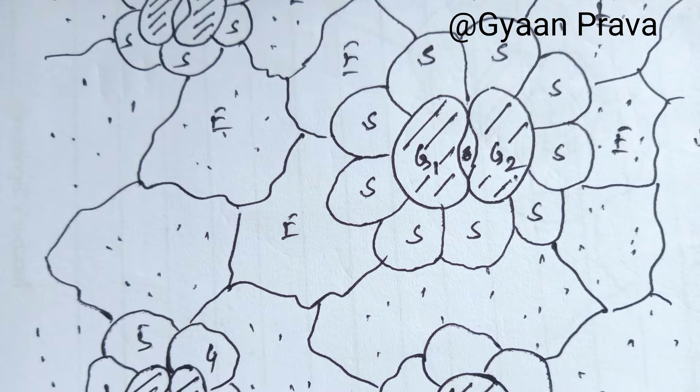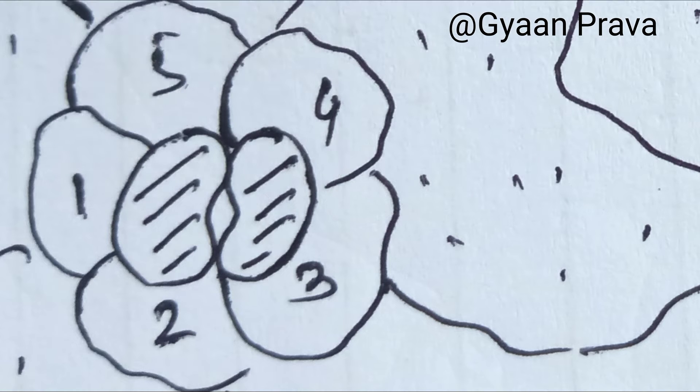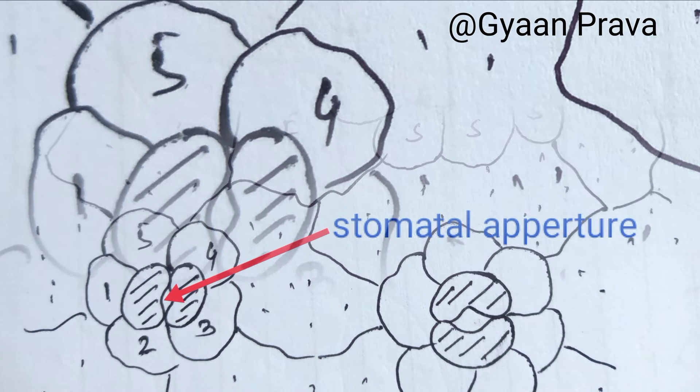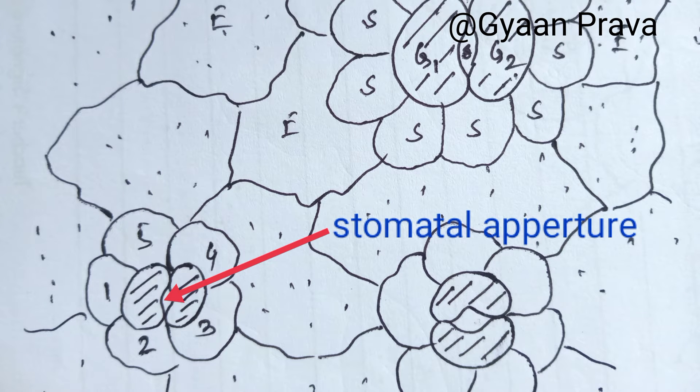In the slide, the guard cells are circled by radiating subsidiary cells. The minimum number of subsidiary cells is five.